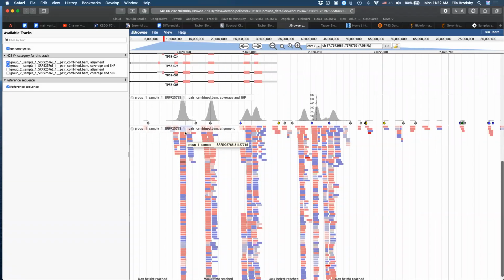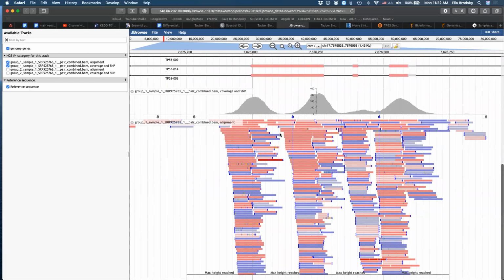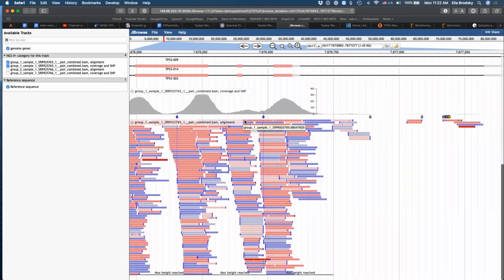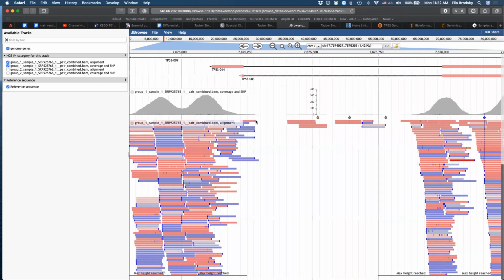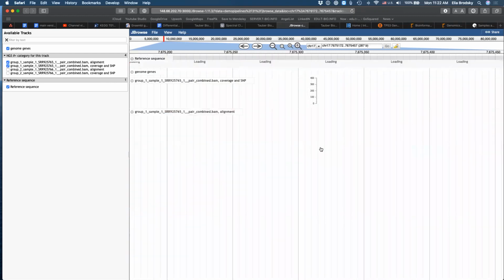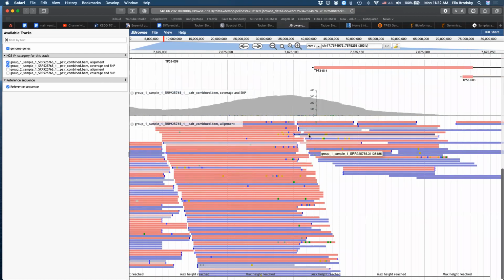to produce a sequence that we can actually trust with high confidence. Because now if you turn your attention to here, there are specific markings across this sequence, okay? And these actually show us the different variants that are found in this sequence. Now you can see that these variants will have different reliability scores for us, because some of the variants are only found in a single read, right?